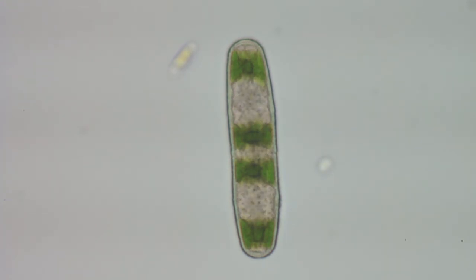So I guess it's a Desmid. It looks like it has a division band starting out here in the center — hard to tell. It's just too big to be a diatom. I guess it's probably a Desmid. I'll know later when I have a chance to get on Google or ask around.